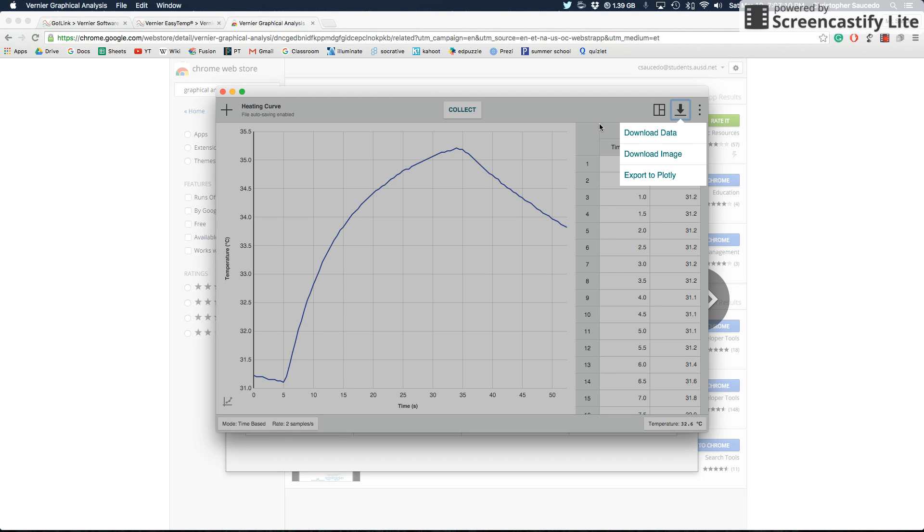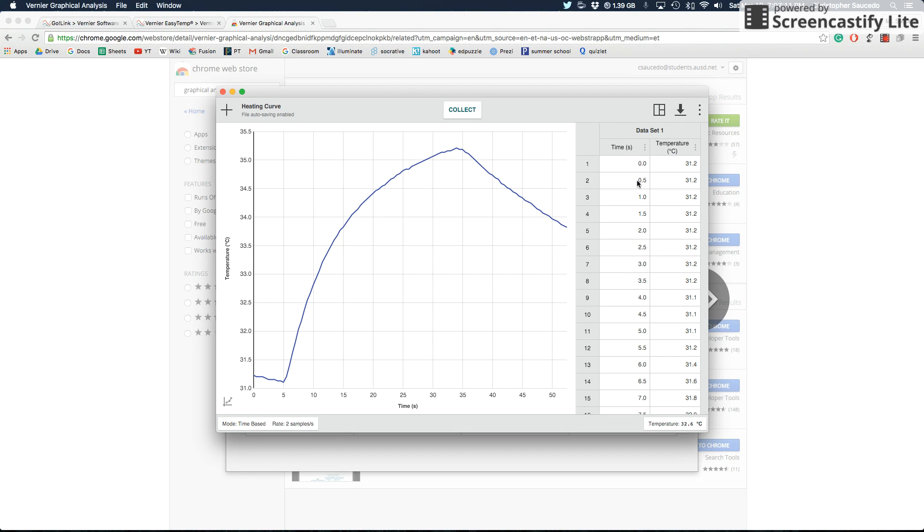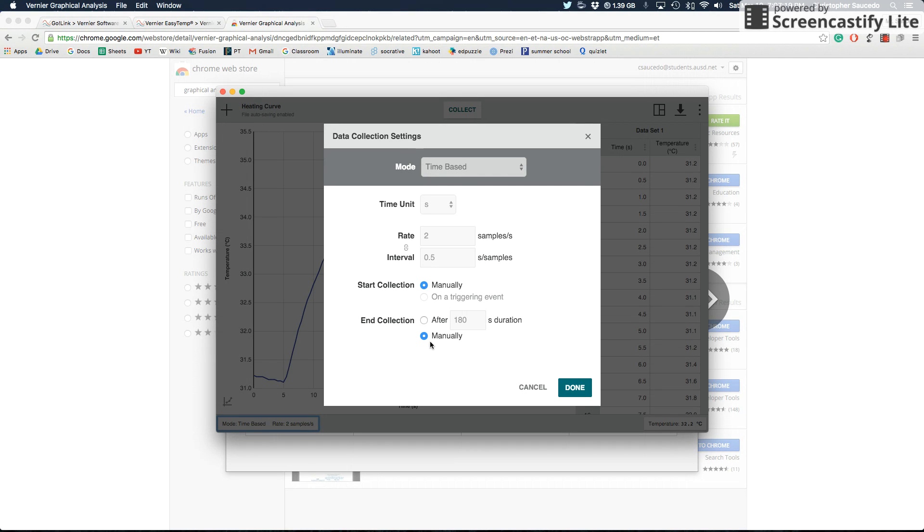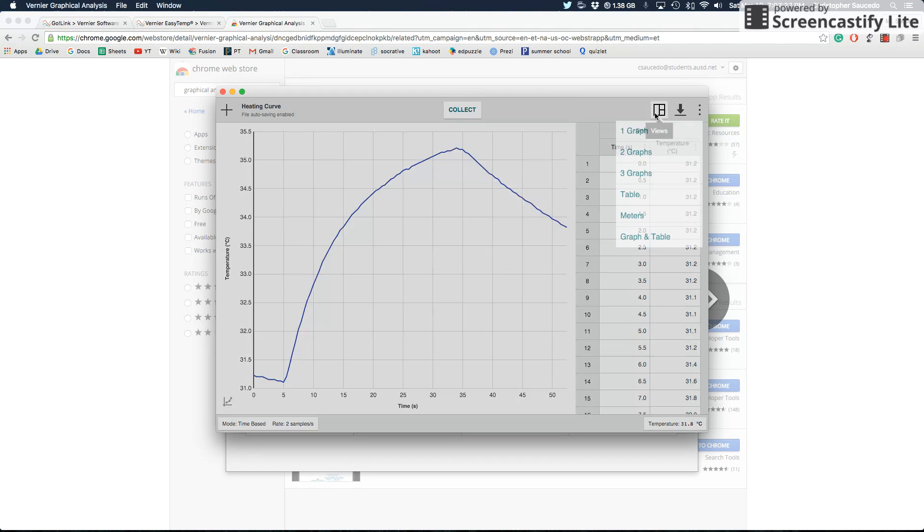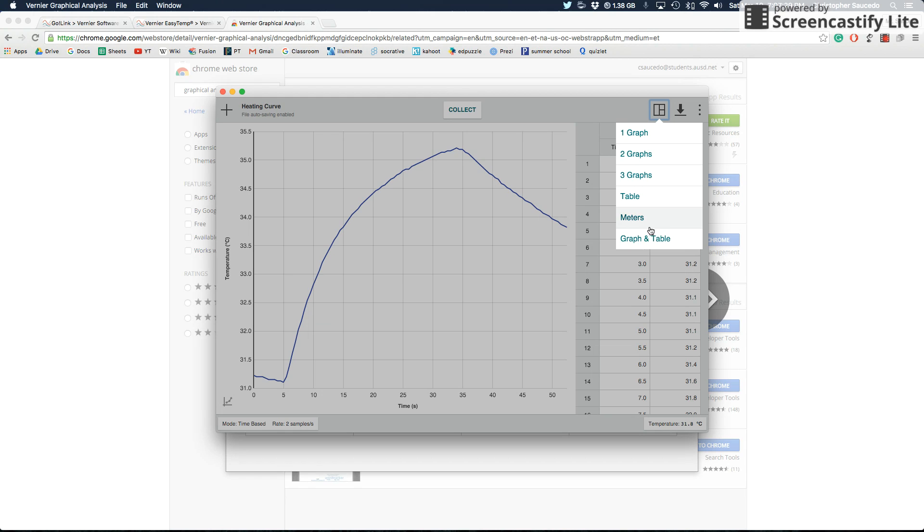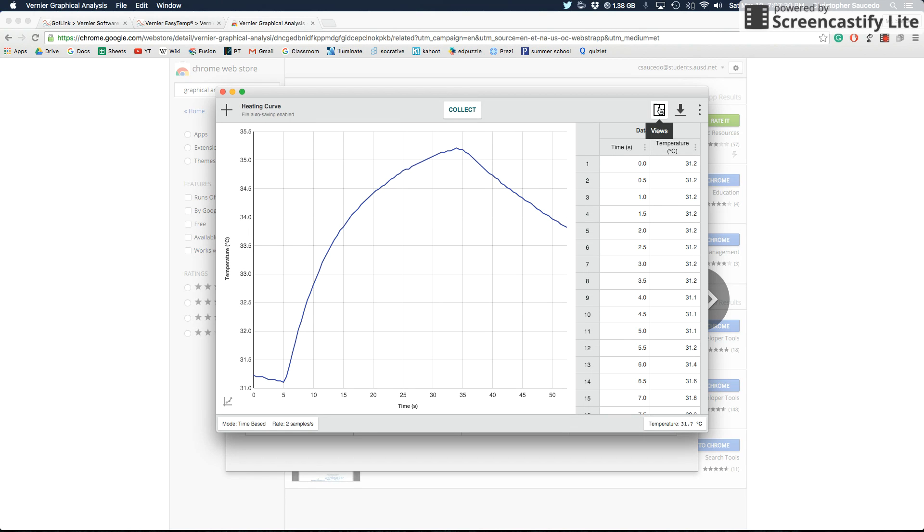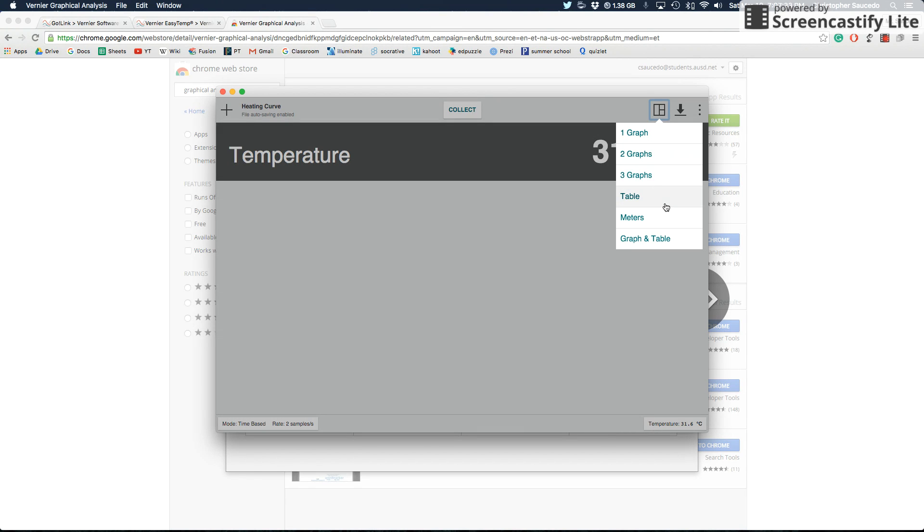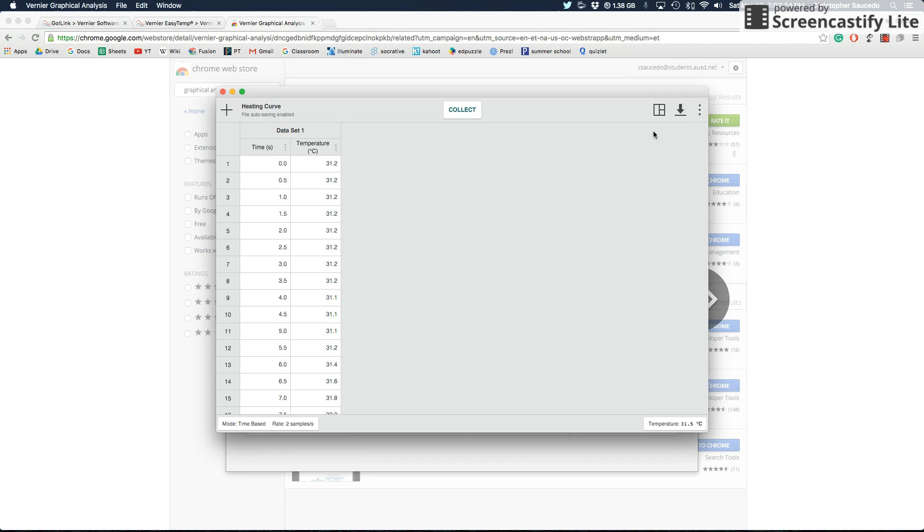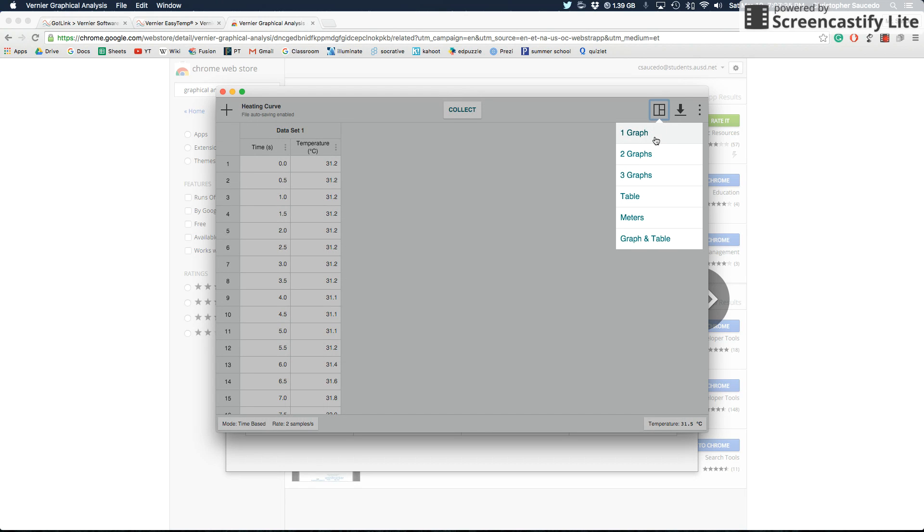That's pretty much all the information that you need to know. You can change the time down here. You can always set it to manual so that it goes on forever. Otherwise, it will stop at 180 seconds and it won't go further than that.